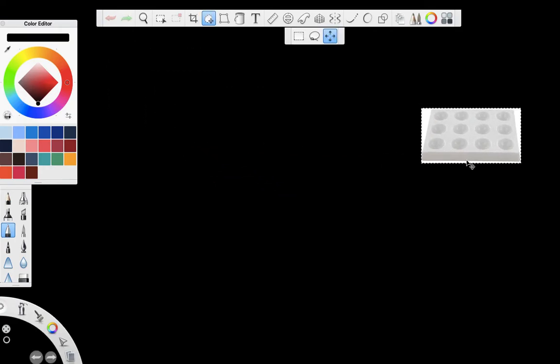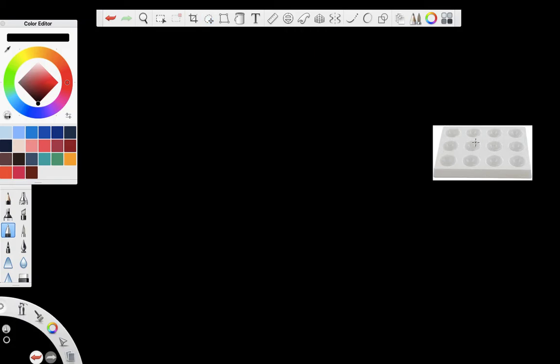So this is your spotting tile containing iodine. So that's your iodine, like so. So we can put underneath here, spotting tile containing iodine.